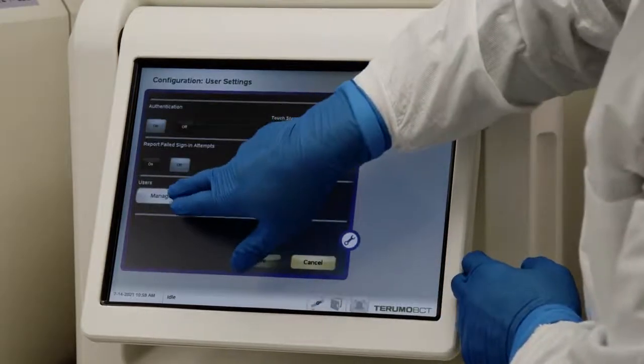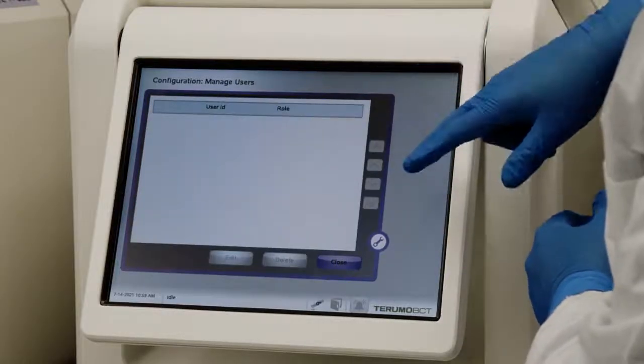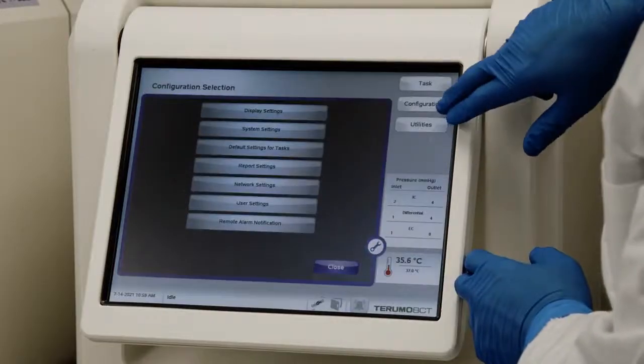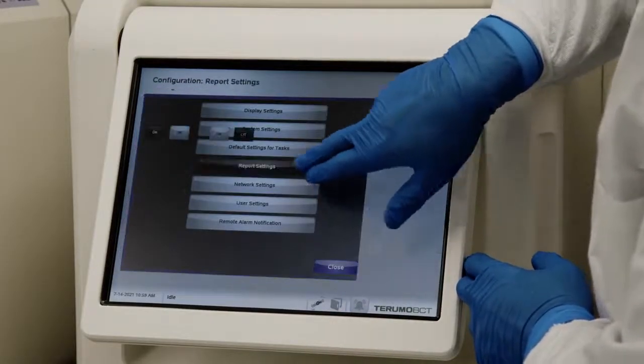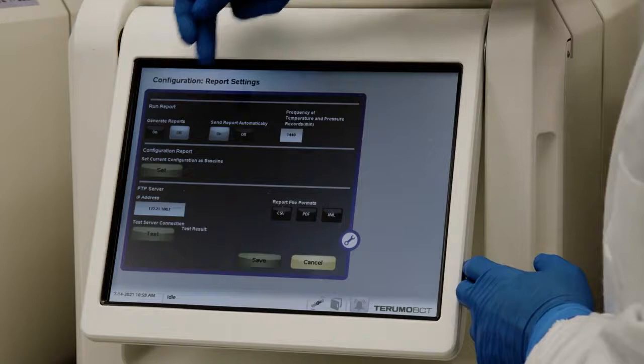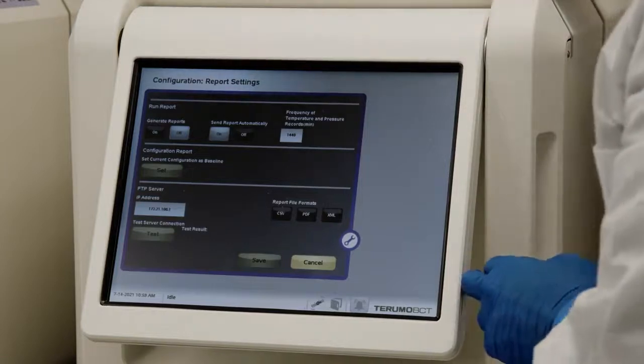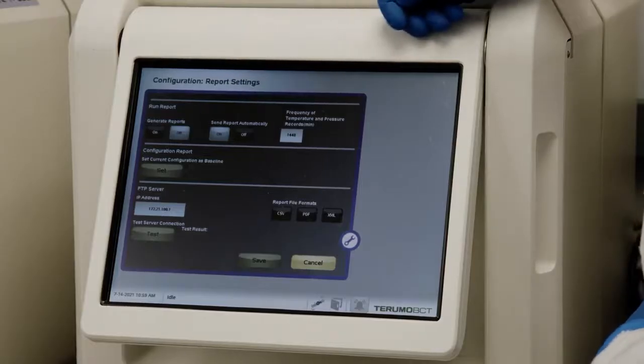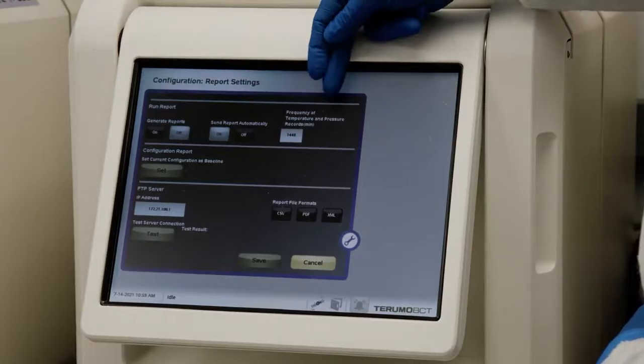And here you can manage all the users and their roles. Run reports can also be generated for each quantum run you perform. You can configure the system to generate these run reports, set the system to automatically send them to a server via the ethernet port on the back of the device, and set frequency of temperature and pressure records for example.